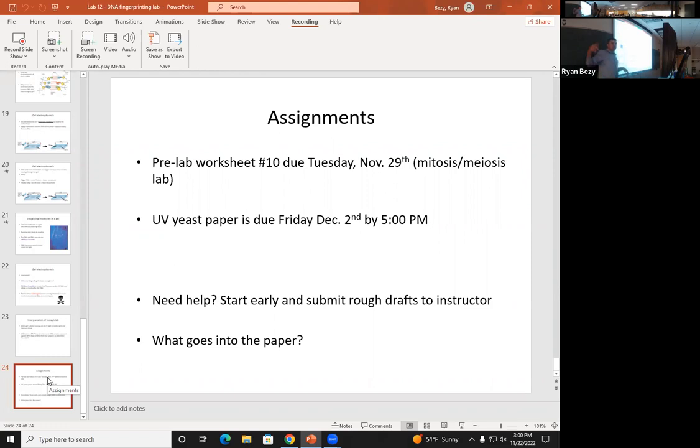I'm also probably going to stop the recording here, but I'm going to show you a few things real quick, just demonstrate some things. Loading a gel is super detailed pipetting work. You got to get your pipette tip into a little tiny well. And it actually takes a bit of technique to do that. You got to get your tip just above the well, but you can't go down into it or poke through the bottom. If you put your pipette tip too far down into the well, you can poke through the bottom of it, and you put your sample in, and it just goes right out the bottom, and you lose your DNA, for instance. And it happens every year, by the way, for at least one well.